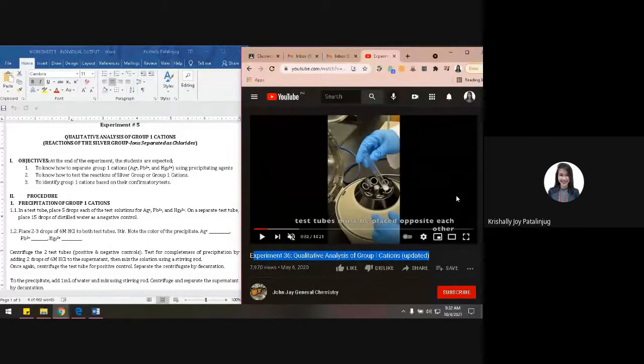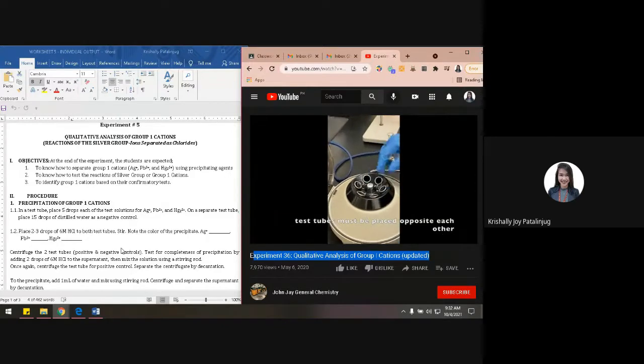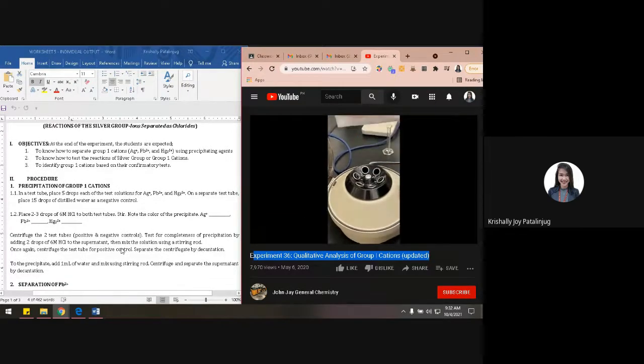Because any irregularities in the mass between the test tubes inside could result in instability of the system, or could cause damage to the equipment itself. So it must be balanced. It must be balanced whenever a material is spinning, right? So that is just the concept, why they are placed opposite each other inside the vessels of the centrifuge.